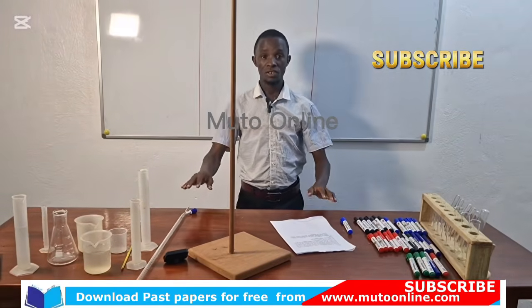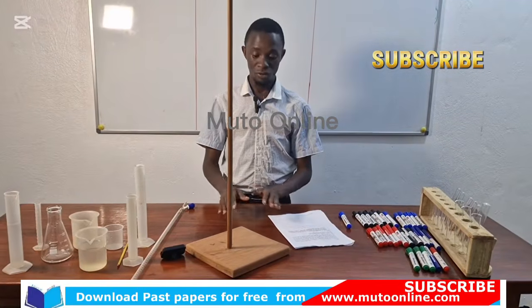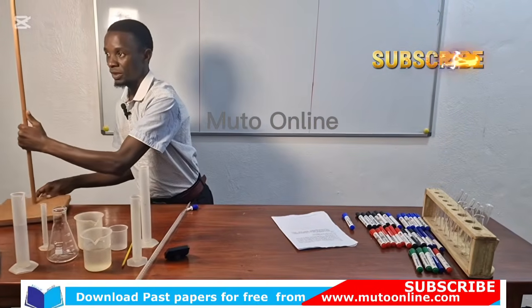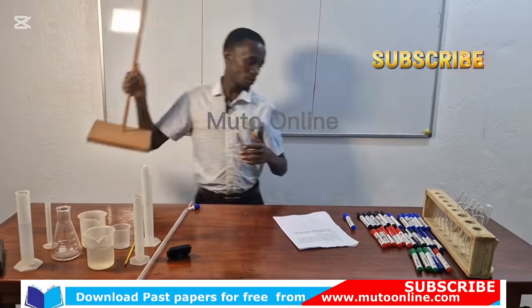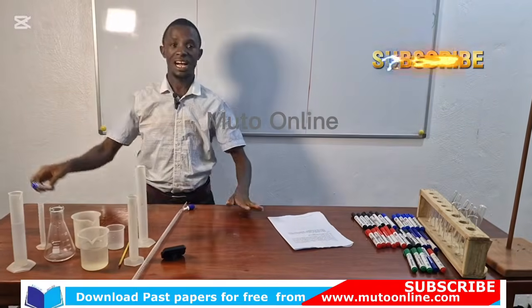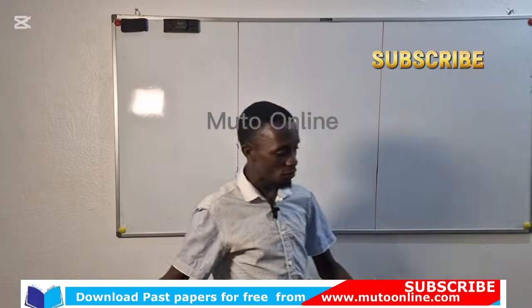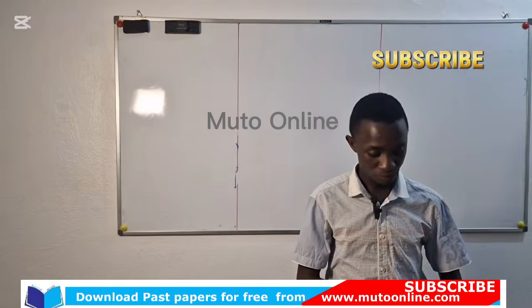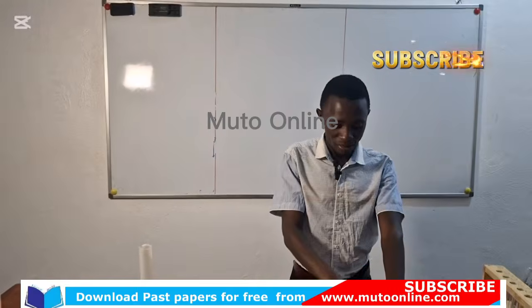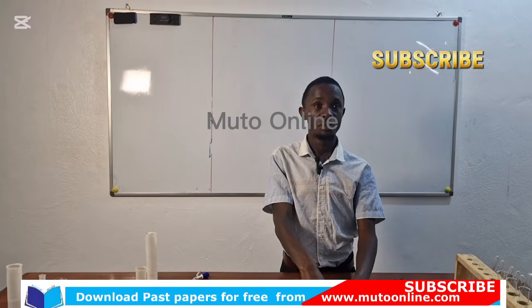Members, we are here to go through practical techniques. We are going to learn practical techniques. I think I put this one aside. And whatever is provided here, not everything is to be used in this practical. So when we read through this item, they are telling us to determine the exact volumes of each solution. We have two solutions, BA1 and BA2.